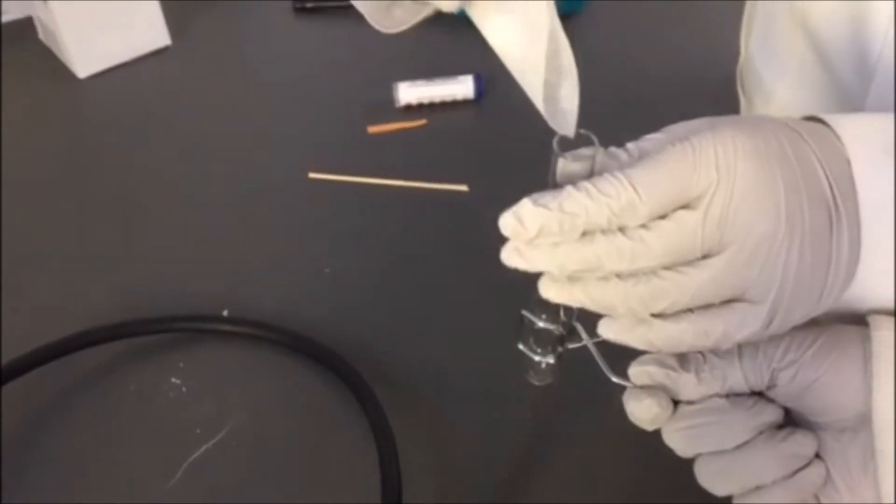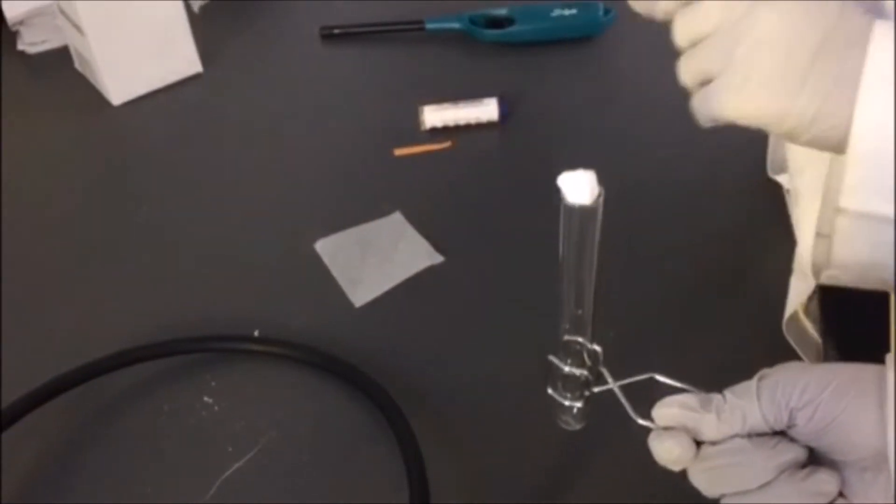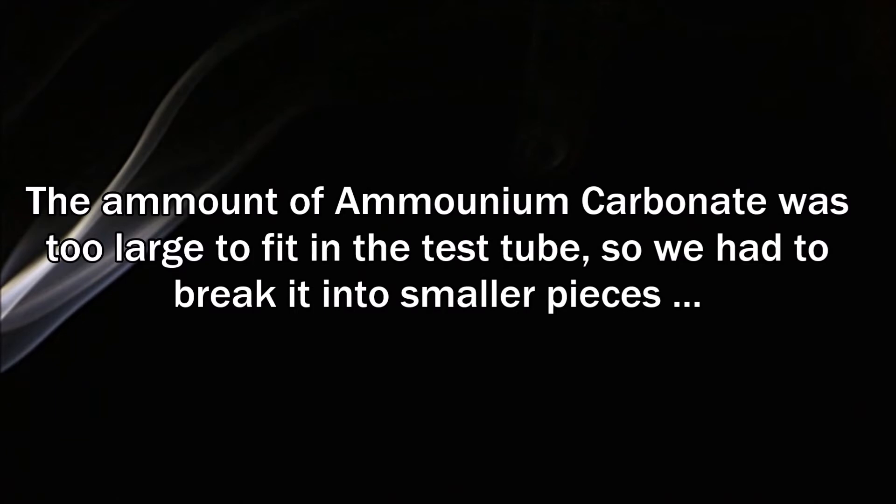So we're placing the ammonium carbonate into the test tube, and then we're going to put it on top of the test tube.